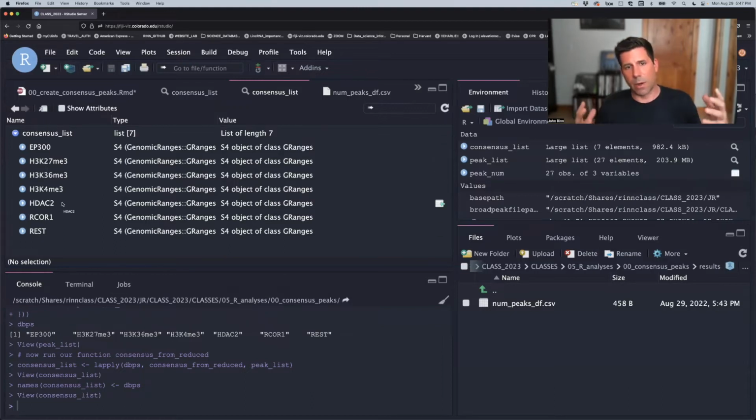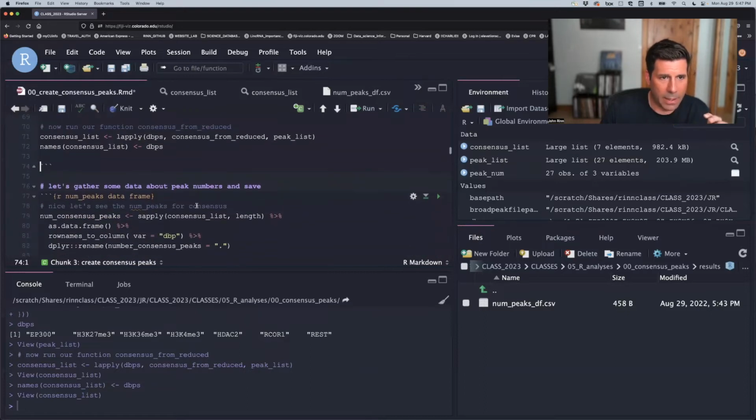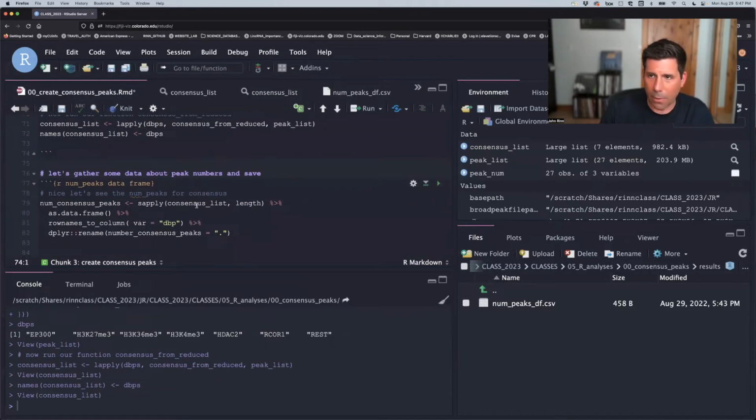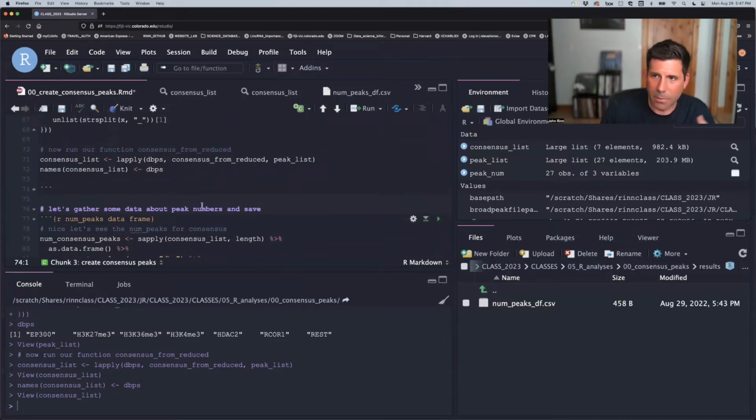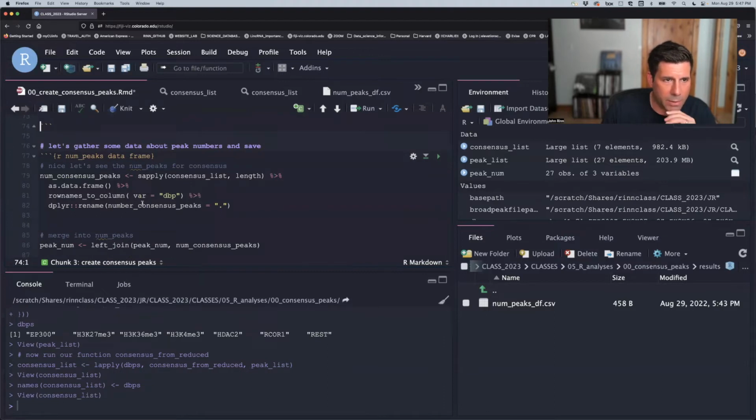And so we've reduced a larger set of data into something we can move forward with and say, these are the peaks that are very consistent and reliable in the ChIP data I have. Where do they land in the genome? What types of genes and places do they land? And that's what we're going to do next. So we're generating the data we're going to use moving forward. Okay, so cool. That's really handy. And later we're going to print all this stuff out and organize it. But for now, we're just doing the concepts, and we'll go through it again and learn through some iterative processes.